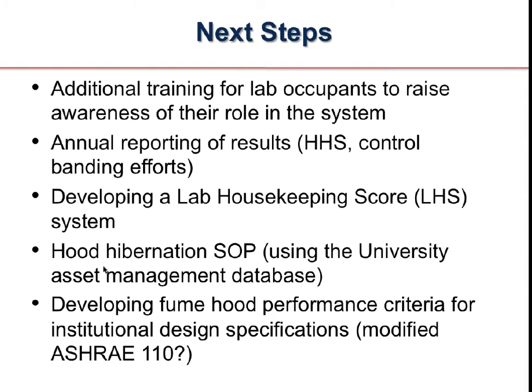The other thing that is more of a training for myself: we'd like to see the high performance, low flow fume hoods come onto campus. I need better understanding of what the modified ASHRAE 110 testing is. There's other specifications out there for the hood performance criteria.